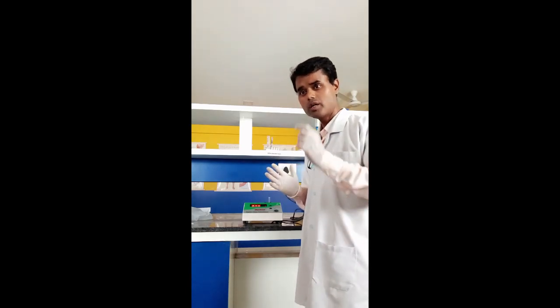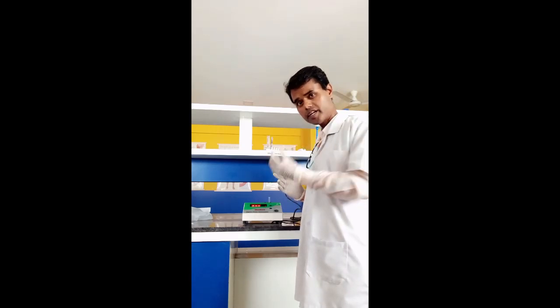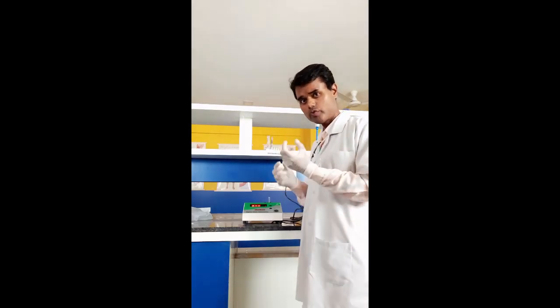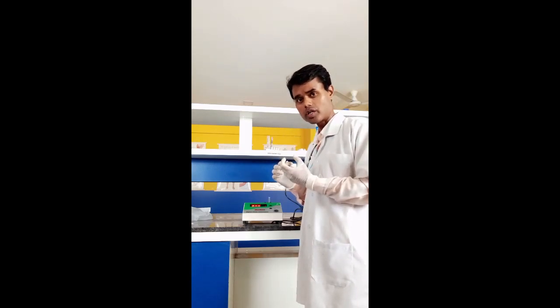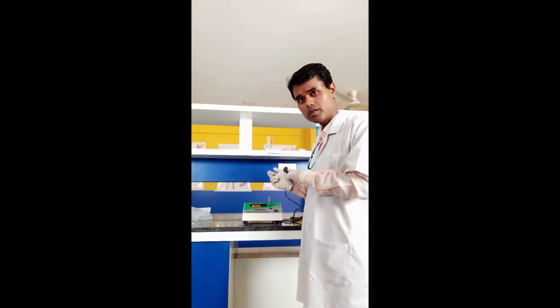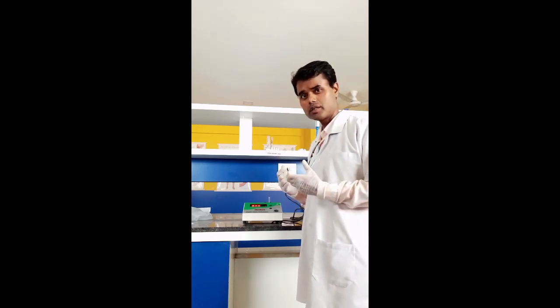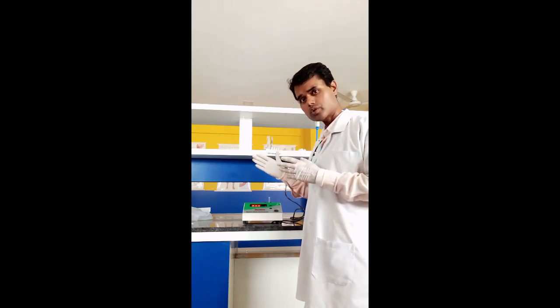So if we want green, then that green filter is there. So it will pass only green light through that filter, and that passed light will fall on the cuvette. Now the cuvette is the test tube where we have put the reaction mixture or reagent for which we want measurement. So when that ray falls on the cuvette, some of the light will be absorbed by the concentration of glucose or whatever analyte is in that reagent, and the remaining part will pass to the photocell.